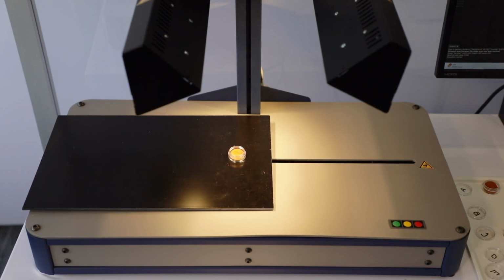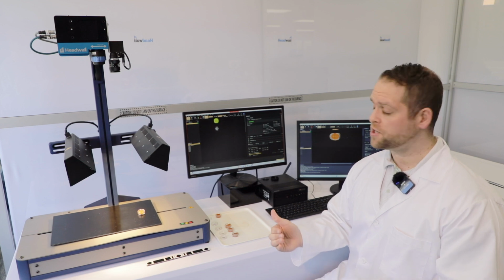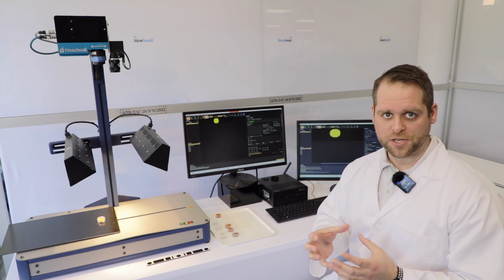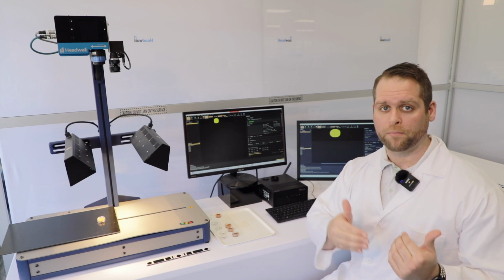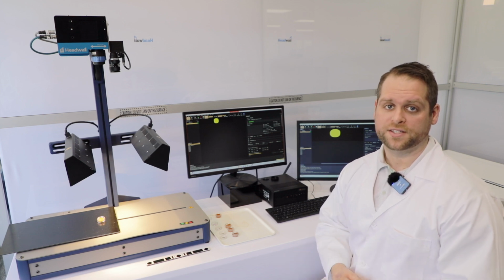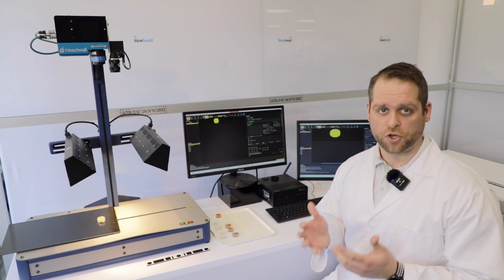By pressing the first button, the stage will move from the designated start and end position. Both the VNIR and the NIR camera will be looking for a cayenne powdered sample object. Once it detects that object, it will crop that region from the overall hyperspectral cube that was collected. It will first save it to memory before it saves to disk. This gives me an opportunity to make sure that everything looks good.